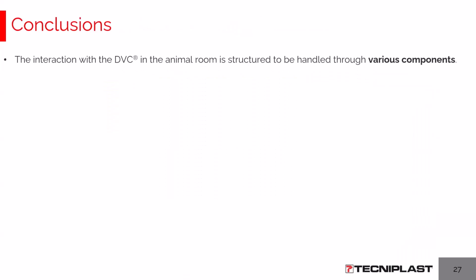Okay, time as usual is running fast. There are so many things to discuss about the DVC analytics that we hope we were able to touch and cover at least the most common, or at least our preferred ones, hopefully also your preferred. I would like to briefly conclude and see if there are open questions.